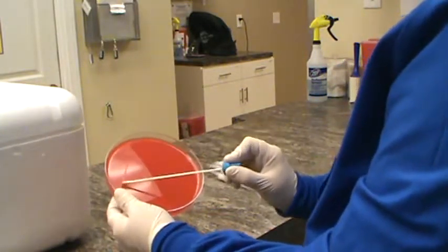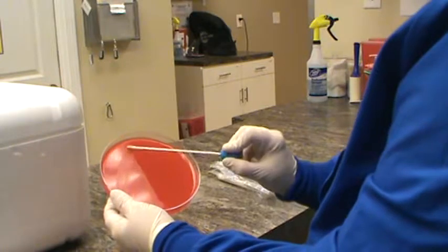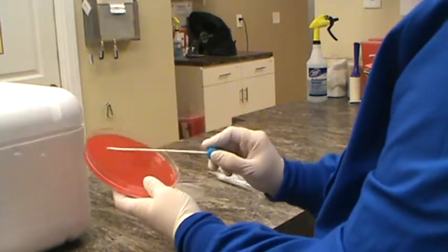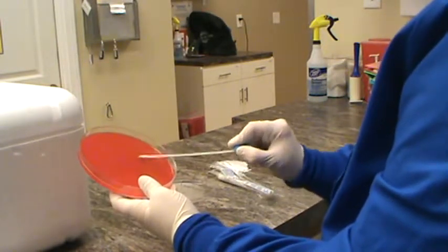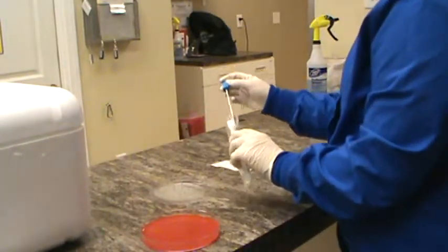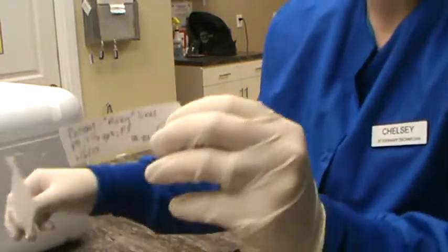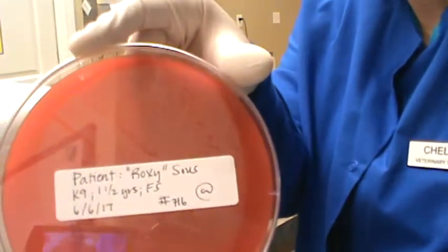So we go across to make our primary smear here, and then we go across again. Cross one more time, and a little zigzag here. So we have our plate properly inoculated. I'm going to get rid of our swab here. I'm going to cover our plate, and then take our patient information off the sticker and place it onto the plate. So we have that there, properly labeled.